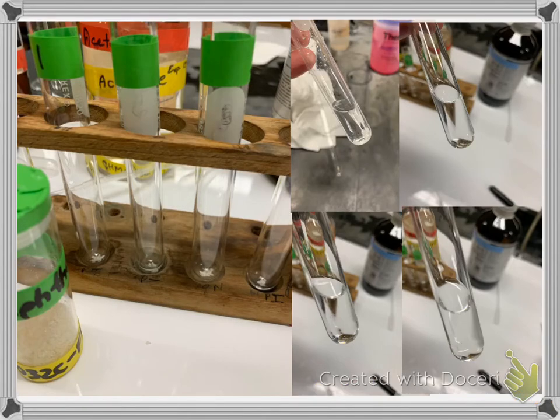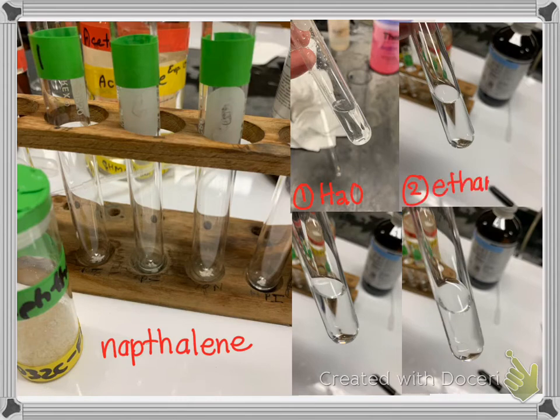The third substance is naphthalene, and you probably were glad you weren't in class for this one. This smells like mothballs. You can see I used very little. And let's see. So this was with the water. This was with ethanol. This was with acetone.